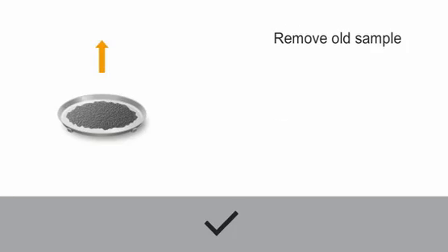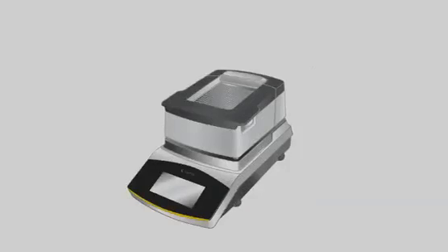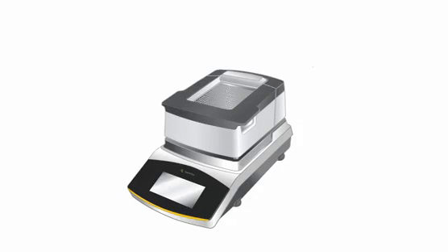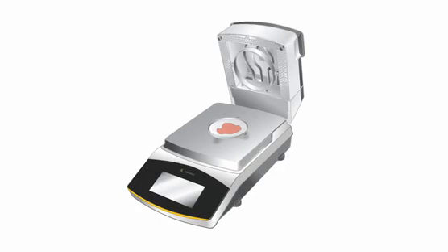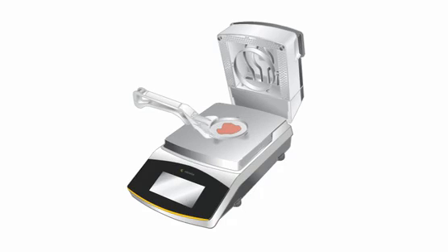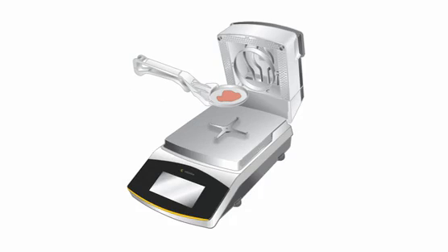In the display, you are now asked to remove the old sample. To do so, please open the hood and remove the sample pan. As the sample pan will be warm, you should use the sample tong for this process. You can discard the sample pan after it has cooled down.